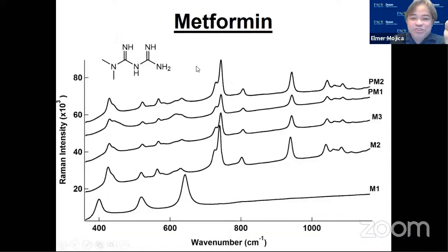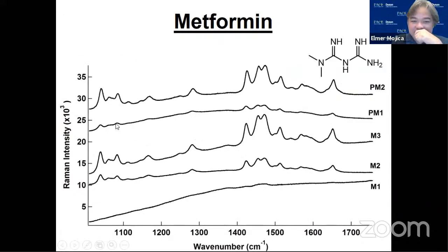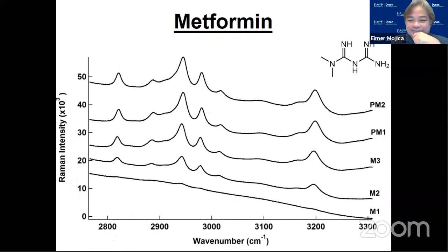So I was in the Philippines in 2018, and my pharmacist did not give me enough metformin. Instead of 45 metformin, he gave me 30. So all of a sudden, good thing I can buy over-the-counter metformin here. When I came back, I had some samples that I told my students to analyze. I found out they're okay, except for this one here, okay? But the rest of the functional groups seem to be fine. And I think the company where the metformin was manufactured is a good one.